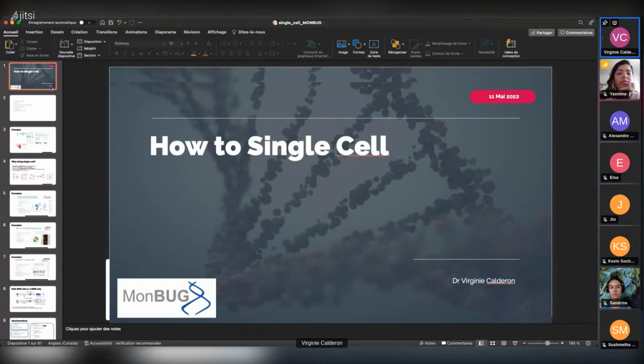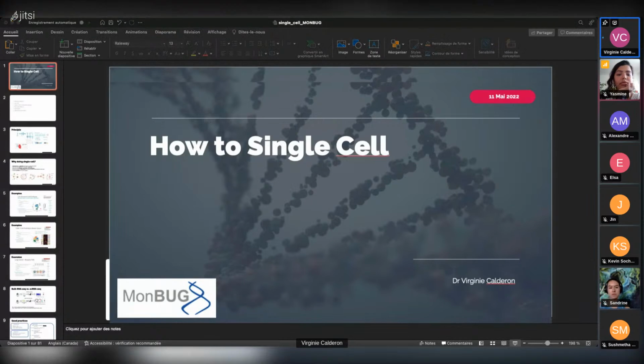So we have developed skills for such analysis. So today I'm going to present you an introduction about the single-cell experiments, the diversity of protocols, so what you can do with this type of data, how to start from the biological point of view, and also the basic bioinformatics analysis, and also how to get to the advanced analysis like data integration, trajectory inference, and pseudotime analysis.